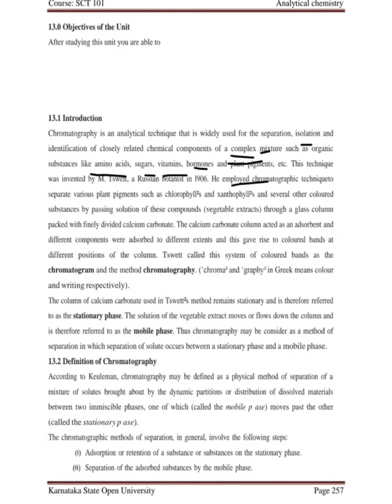Again, chromatography is an analytical technique which is used for separation. By using the chromatographic technique, we will get different bands, and that is known as a chromatogram. This method is known as the chromatographic technique.